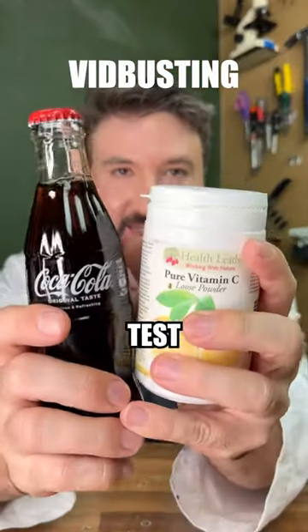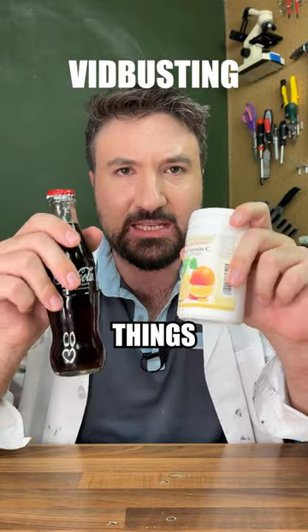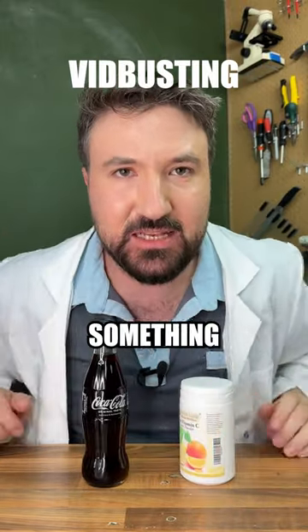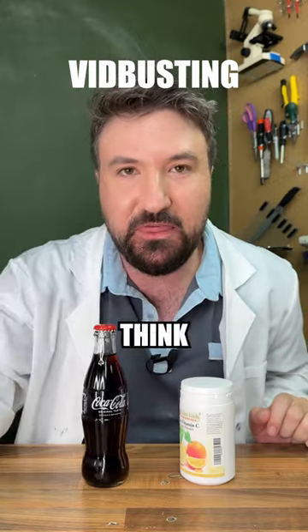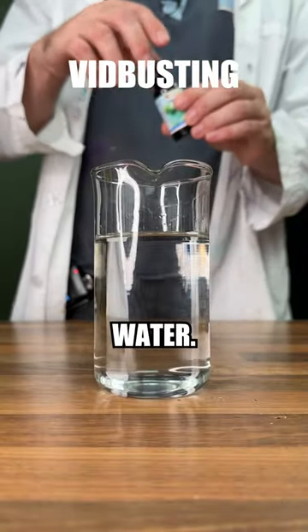Continuing with some myth-busting, let's test that video. Having seen a few videos where people already combine these two things and nothing much happens, I think there's something more interesting going on here, and I think it's to do with this iodine. I've got our beaker here filled with some water.